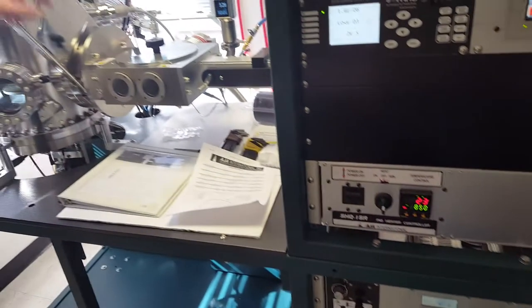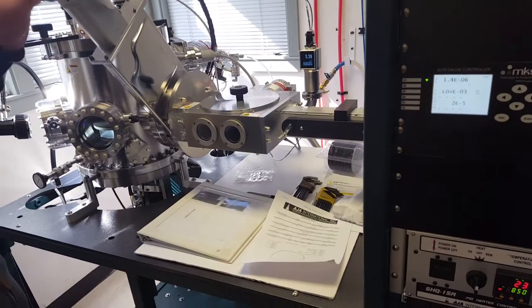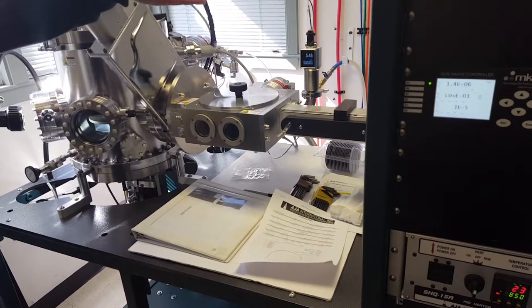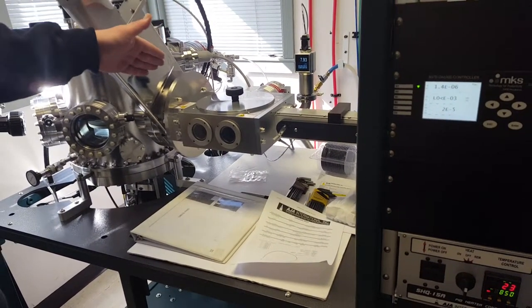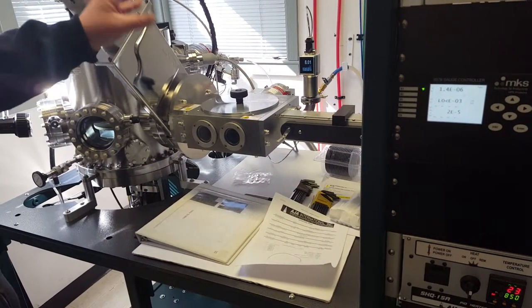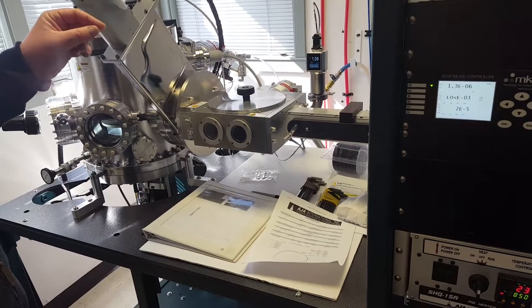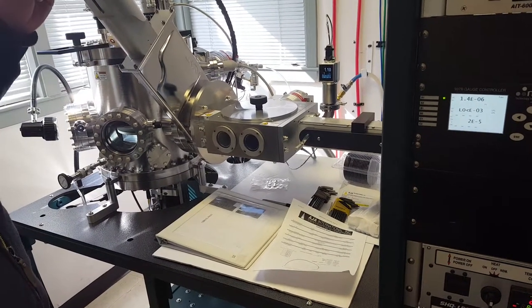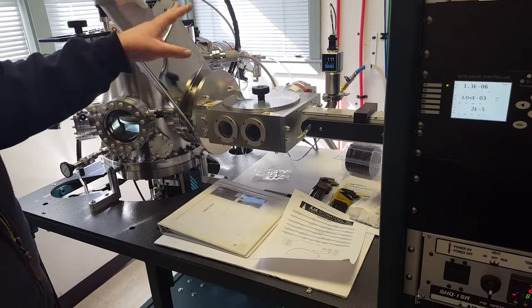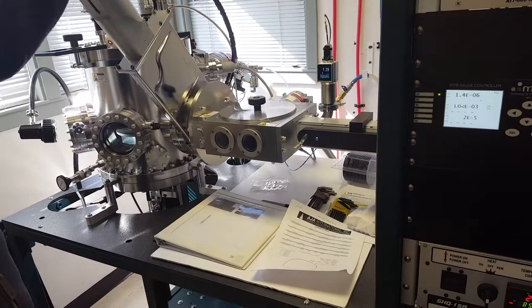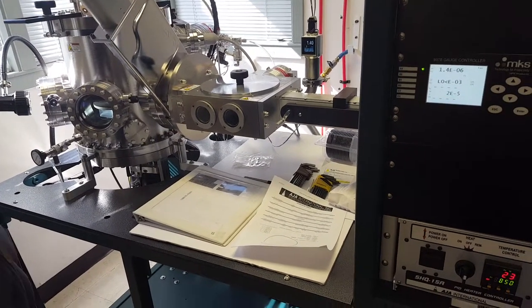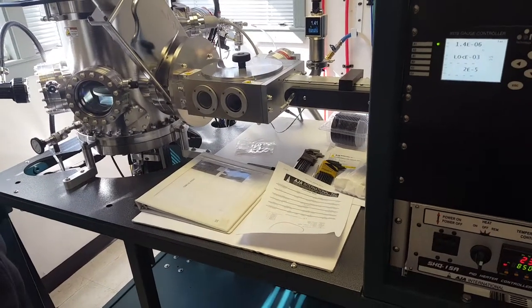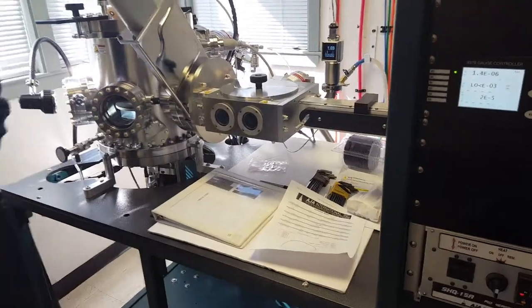That clicking noise is just allowing a short burst of nitrogen, or in this case, we're just venting with atmosphere. This allows a short burst to slow down the turbo a bit until it's slow enough, and then that valve will open all the way, vent the chamber all the way to atmosphere. Grab some gloves.